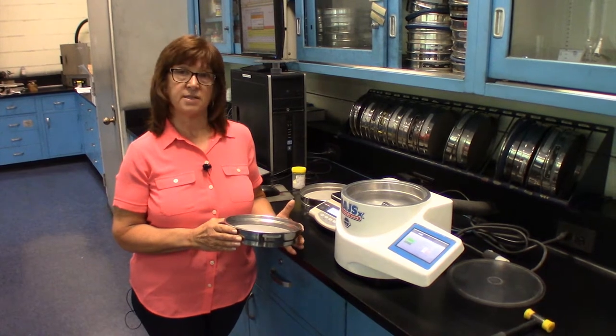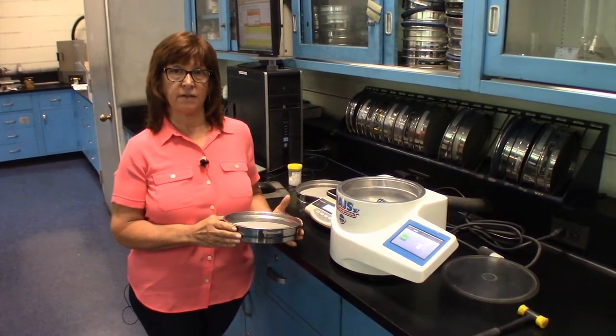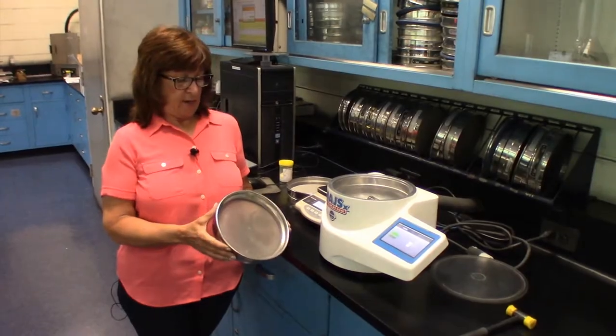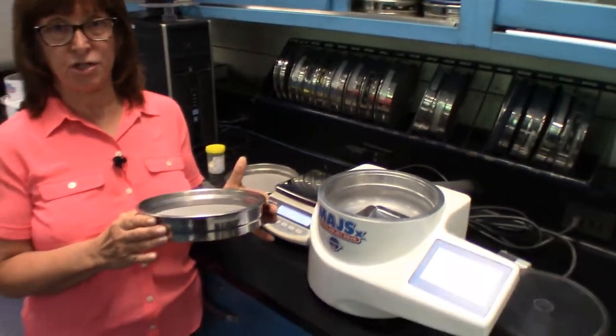Today we're going to be doing an analysis with coffee creamer on the MAJS-XB, which is a basic version of the Jet Sieve. The screen I'm going to use today is a 200 mesh screen and I will be using a 120 mesh screen.